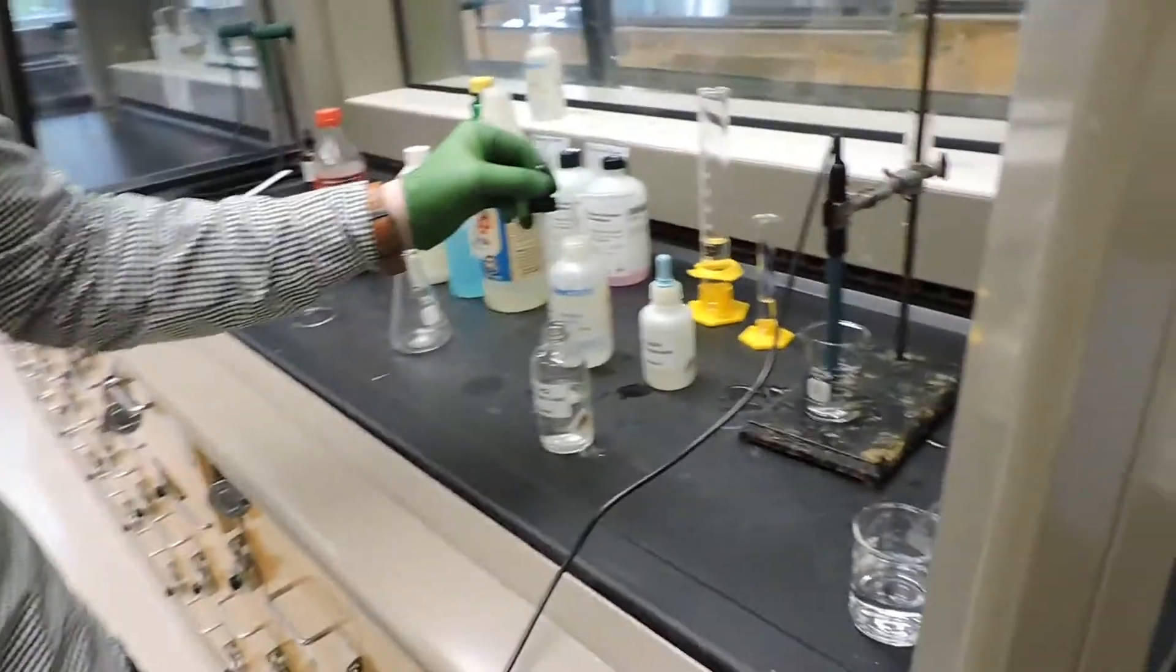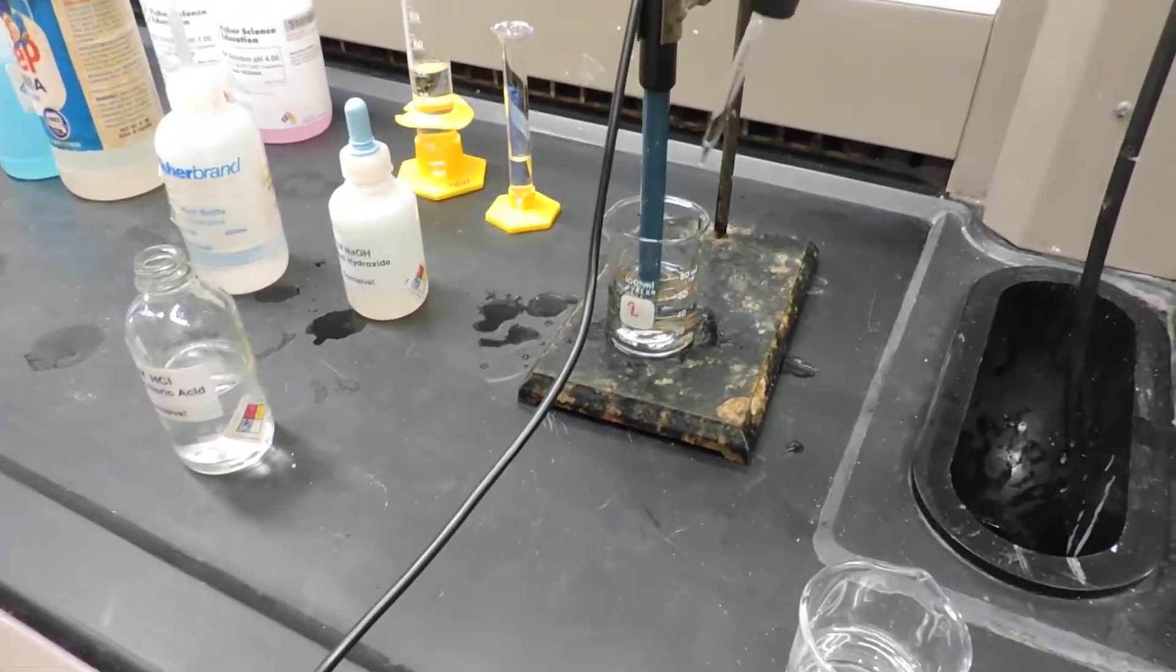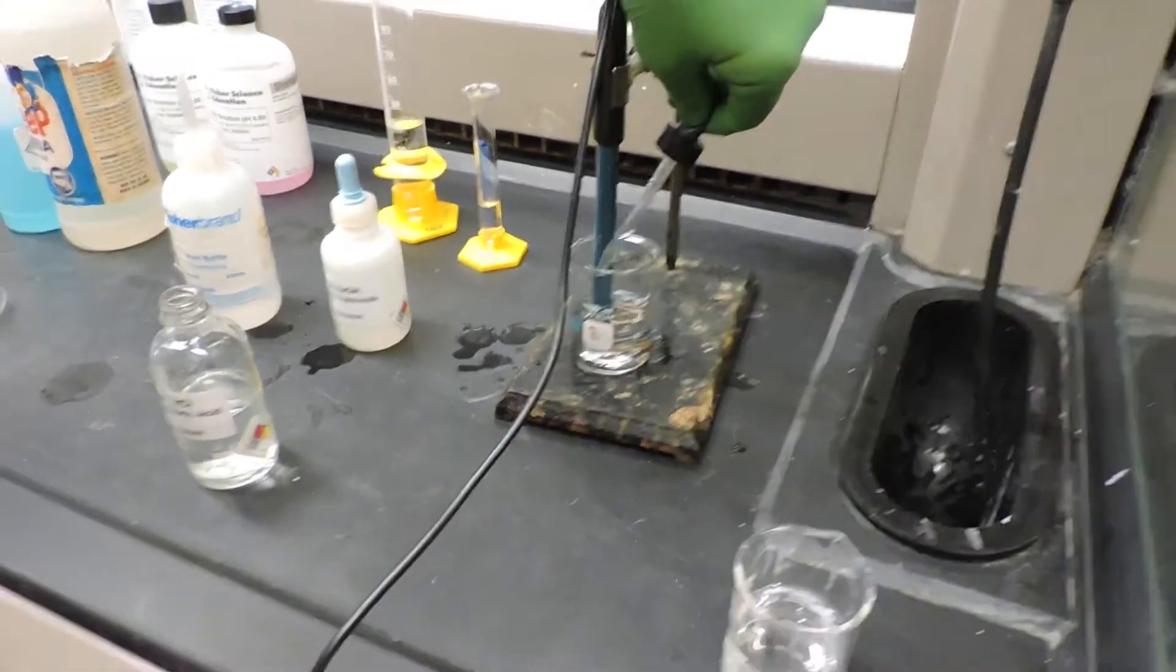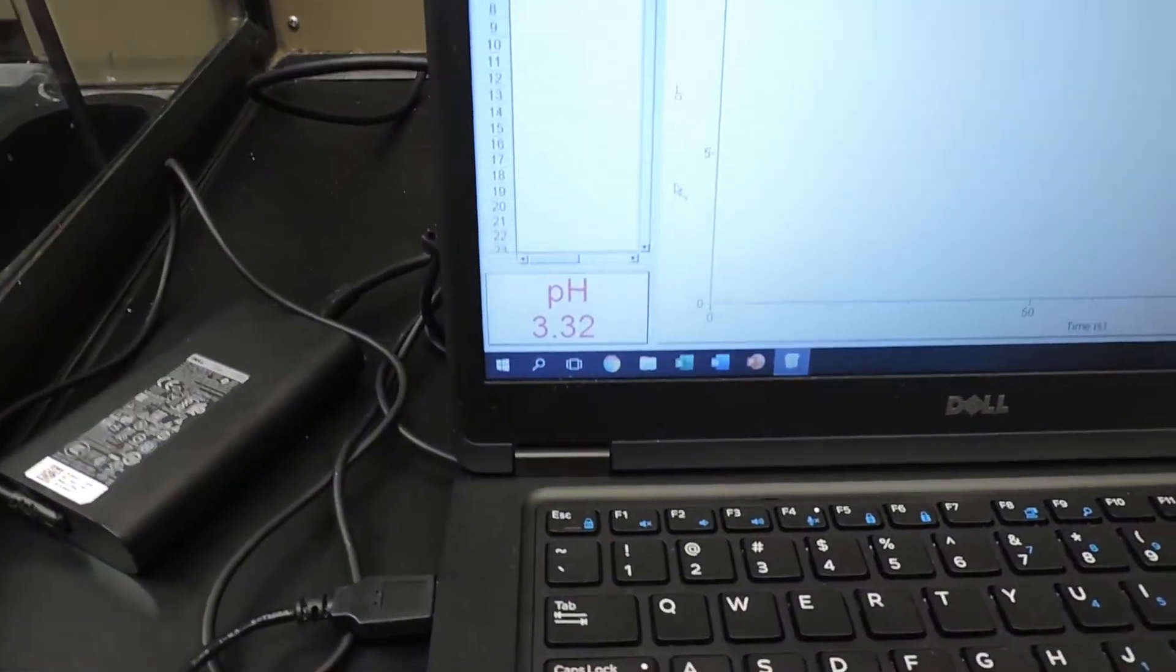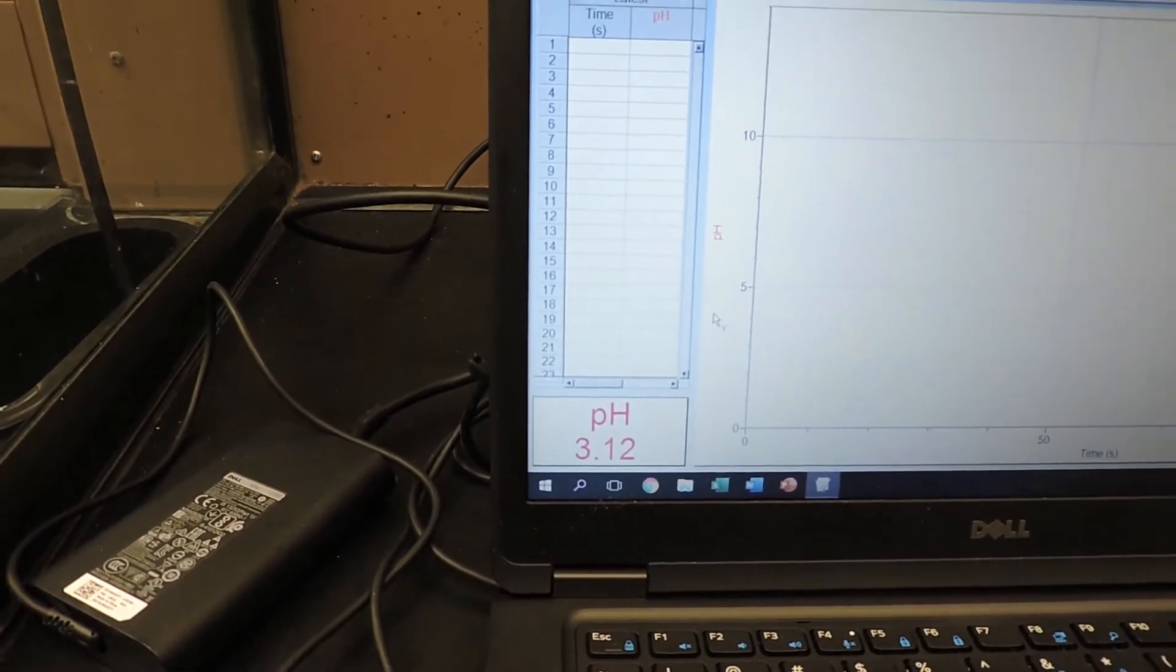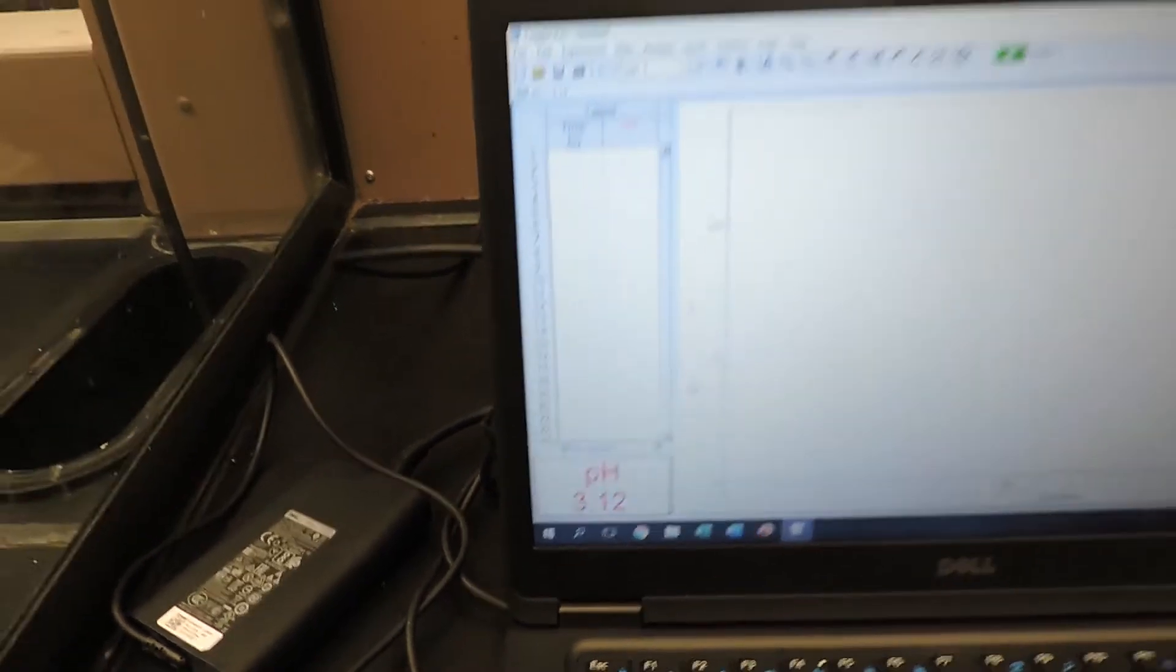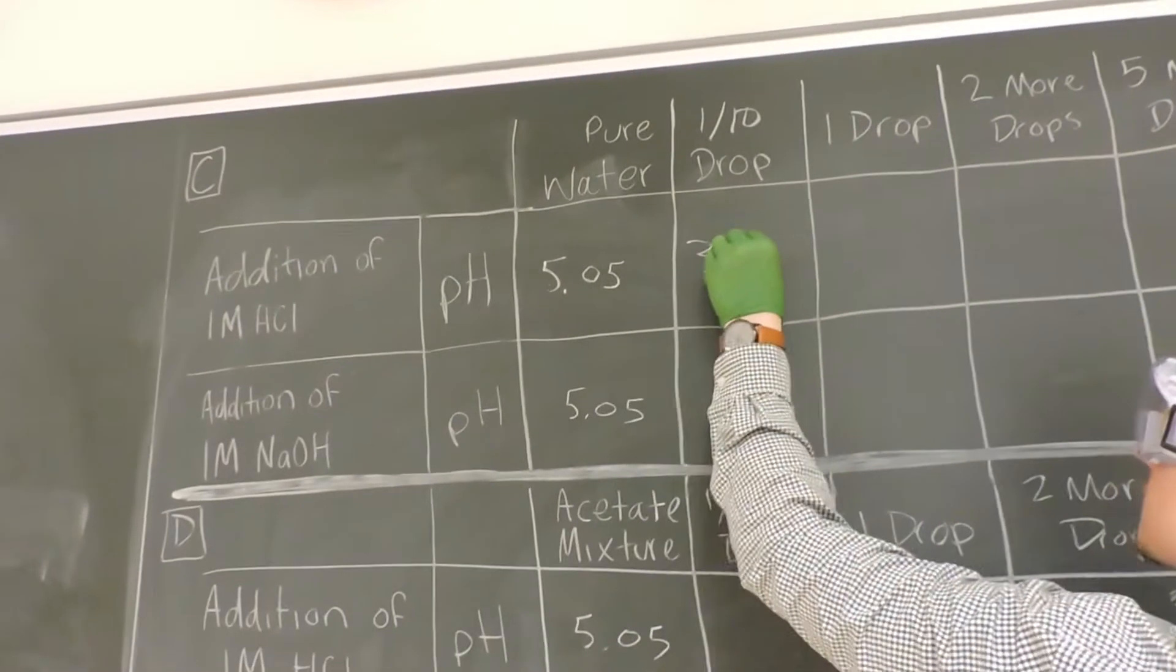For our one tenth of a drop, Jared's going to try his best. And then we can stir using the electrode to stir the solution. You can see the pH is already starting to go down.